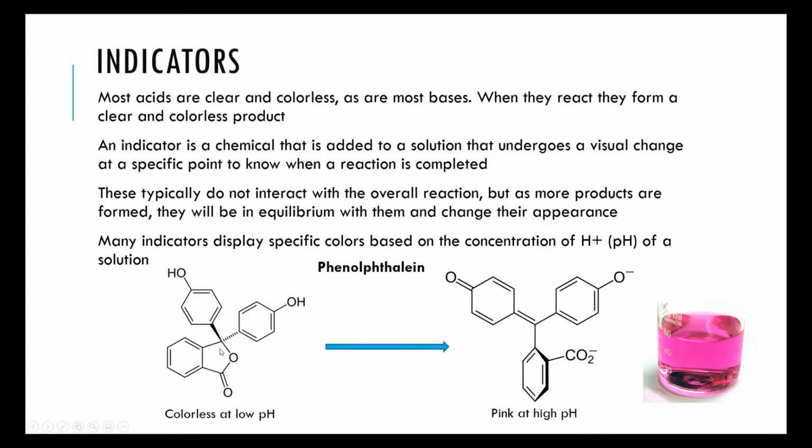And because it's broken, there is no color. In this particular indicator, it alternates between colorless and light pink or fuchsia in color.